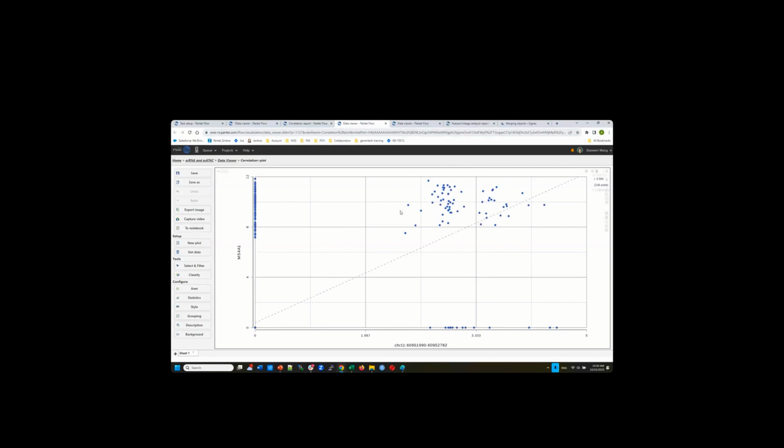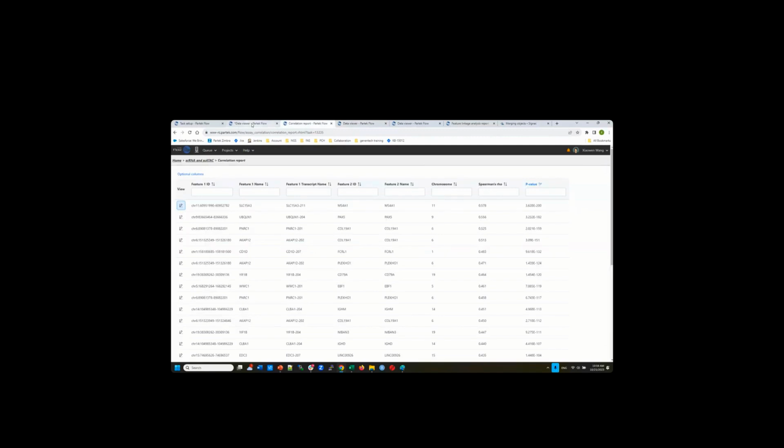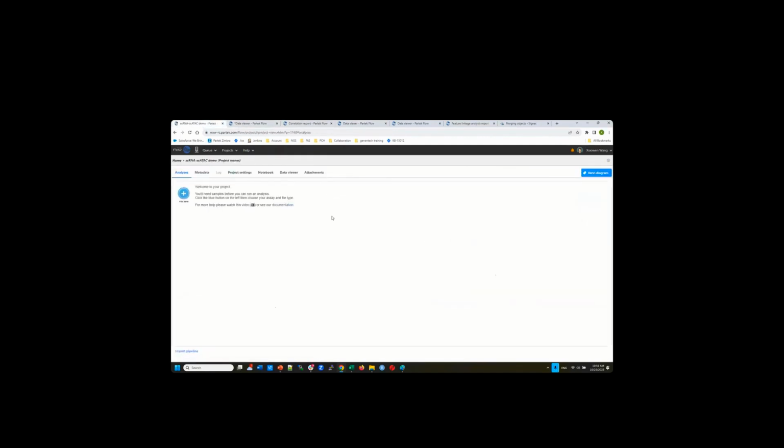Of course, you can perform it, but you have to do it for different correlations separately, just to filter down to only the non-zero values for each SE and then perform a correlation. Okay, so that is how you integrate the 2 SEs.